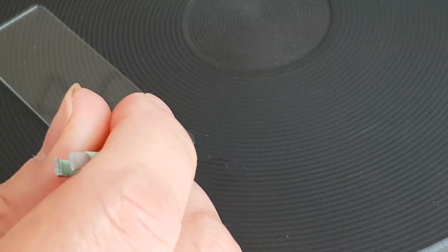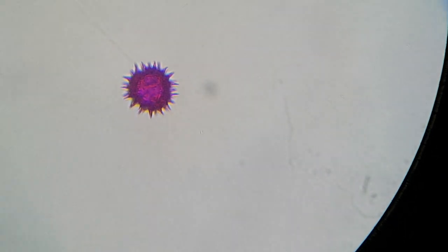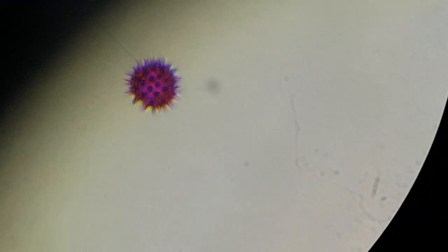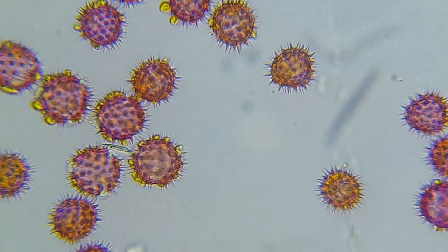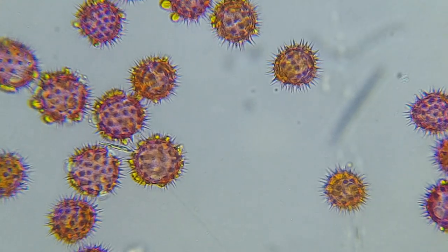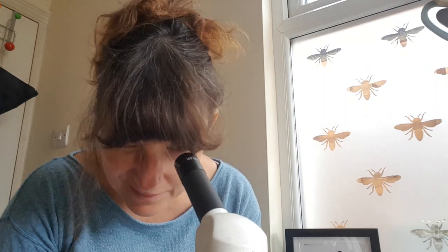That can sit on the hot plate for about 10 minutes and then we'll put it underneath the microscope. Okay, the slide's underneath the microscope - let's check out sunflower pollen. Oh wow - isn't that incredible! I can see why people get into microscopy - I love this, this is awesome.